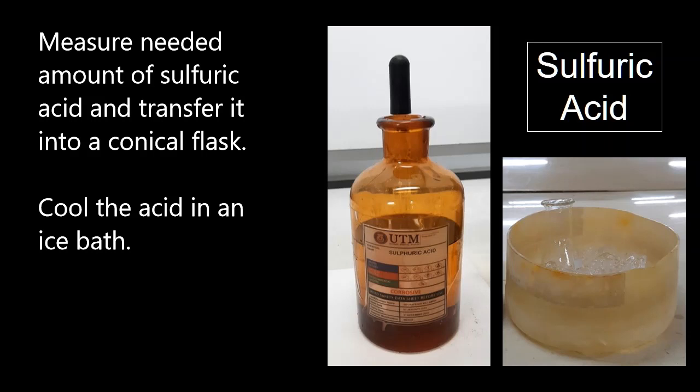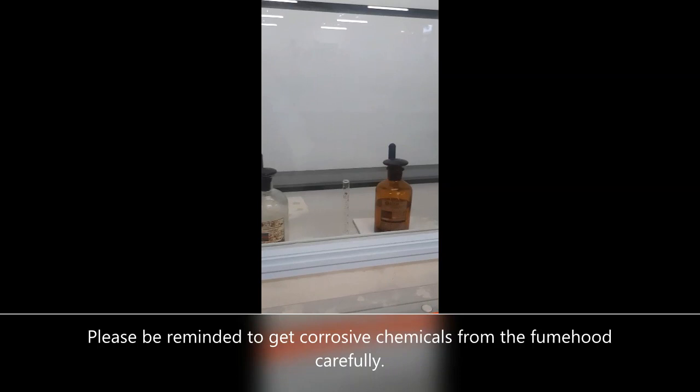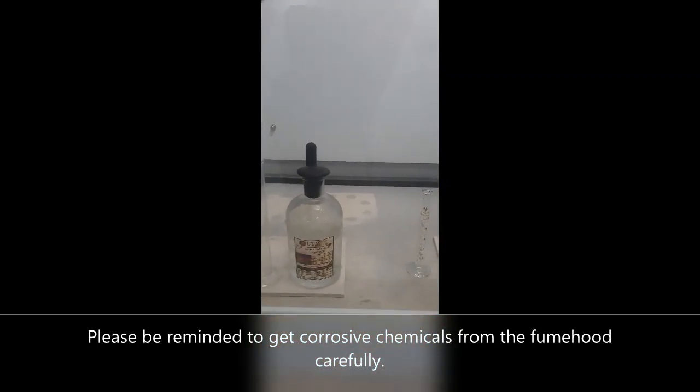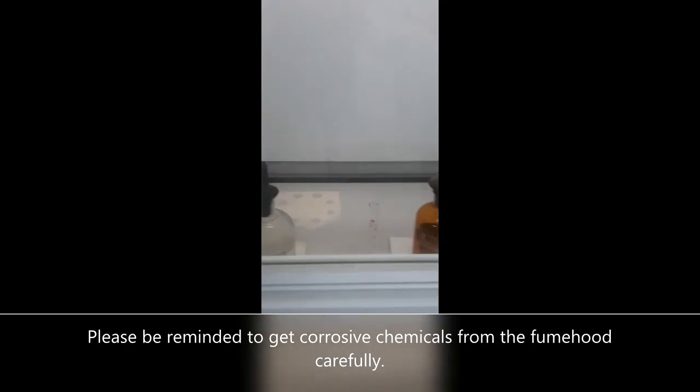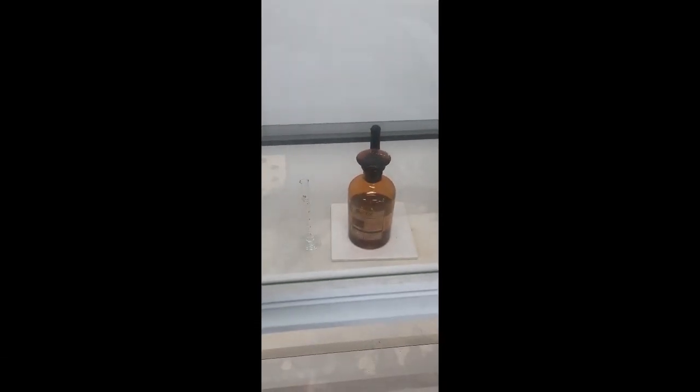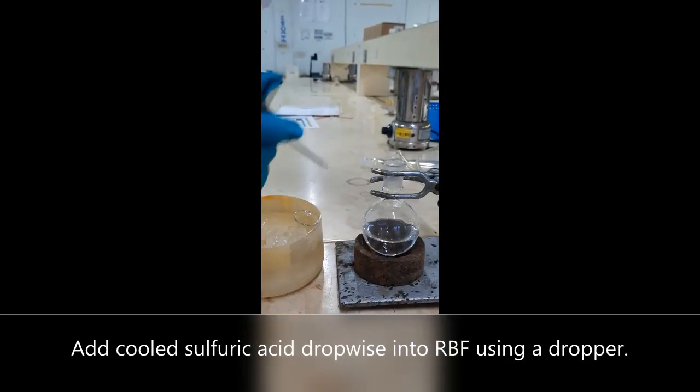Measure sulfuric acid in a volumetric cylinder and pour into a conical flask. Cool the acid in an ice bath. All corrosive chemicals are found in the fume hood. Carefully measure the needed chemicals using volumetric cylinder.